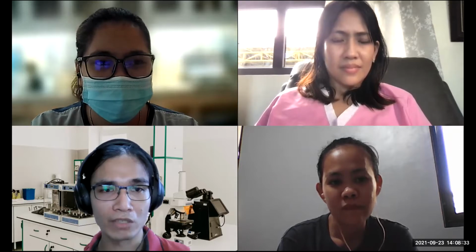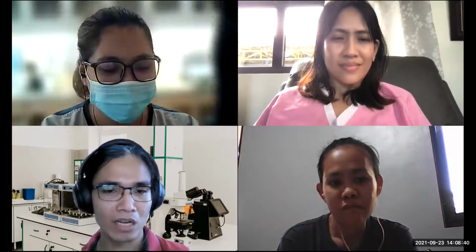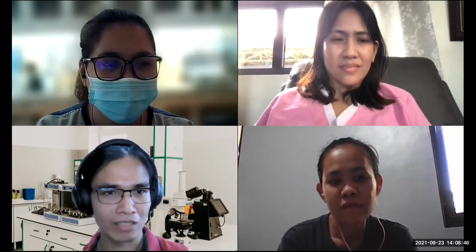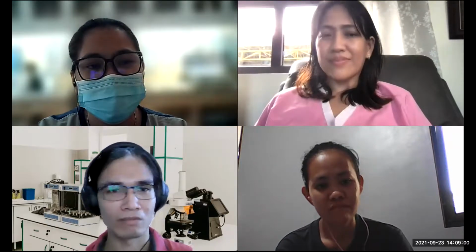Actually, Doc, the reason why I asked is I'm familiar with what are called point-of-care diagnostics. I'm not sure if you've heard of it, but with point-of-care diagnostics you go to the place where the patient is, for example, a farm or hospital. Even though they don't have a dedicated laboratory, you can just bring the equipment, do the diagnostic, and get out.